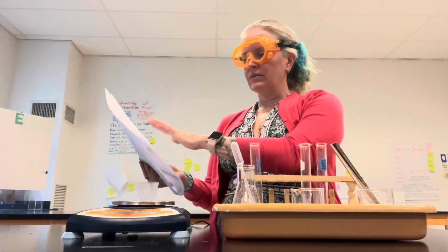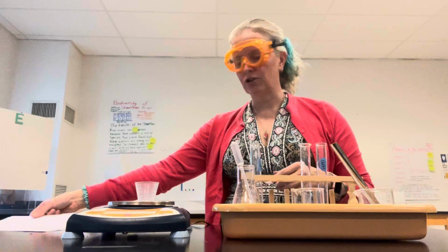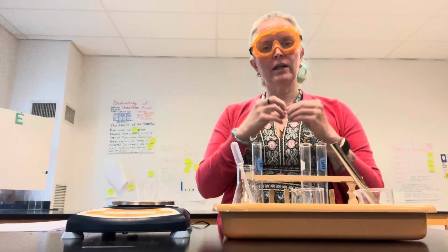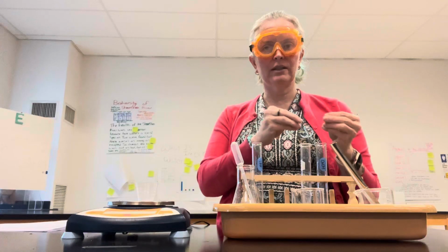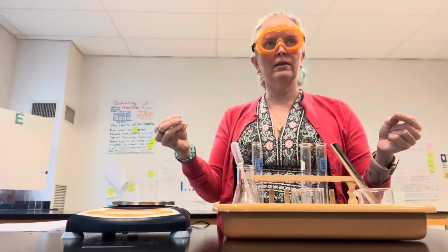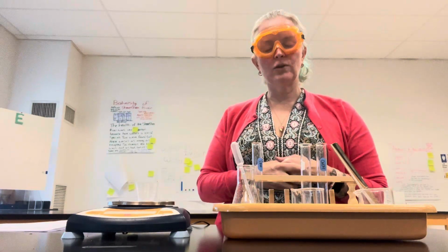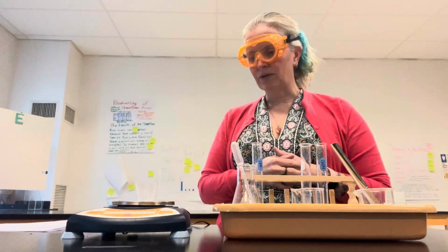And then on the back of your paper, there's a place for you to explain how you would separate your mixture. So this is sand and water. You would want to think of a creative way to separate the sand from the water. If you can't think of a way to conserve both the sand and the water, then you could come up with a method that at least conserves the sand. So you could first try to think of a way to separate the sand and the water so that we get both the water and the sand back, but separately. If you can't think of a way to do that, then you could come up with a way to at least get the sand back and remove the water from the sand. That would be another idea.